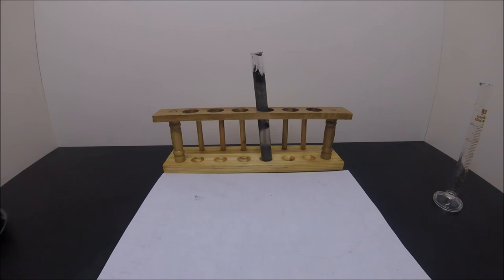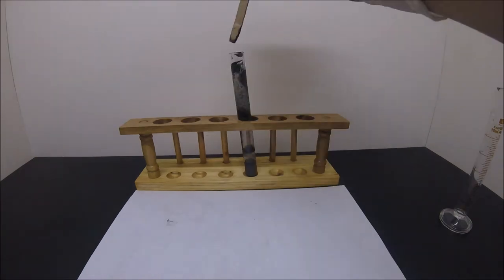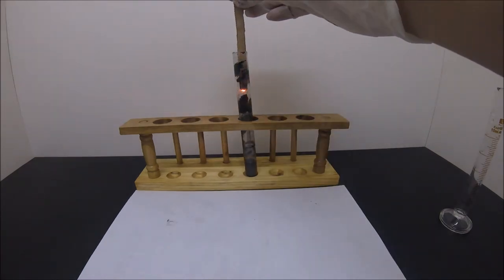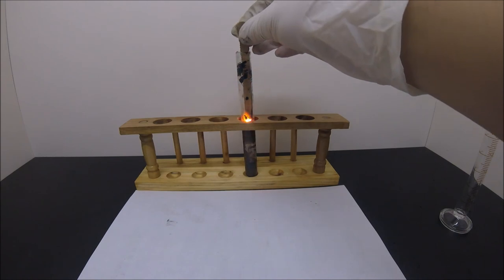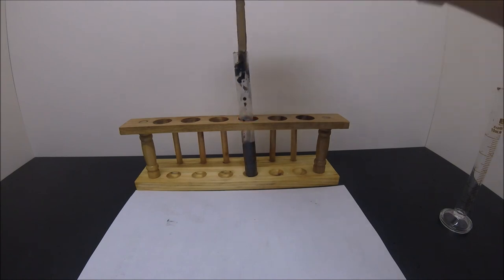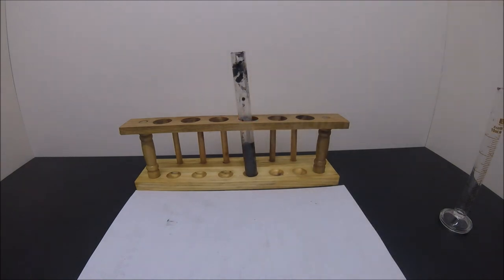Then I dip the glowing splint into the test tube, and it quickly reignites, which proves that we have manganese dioxide.